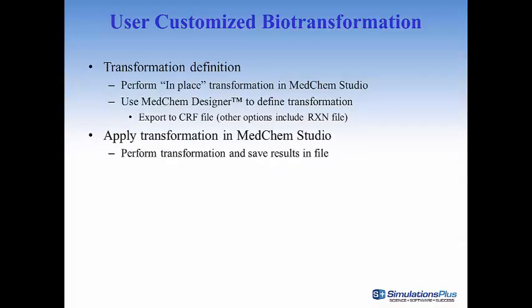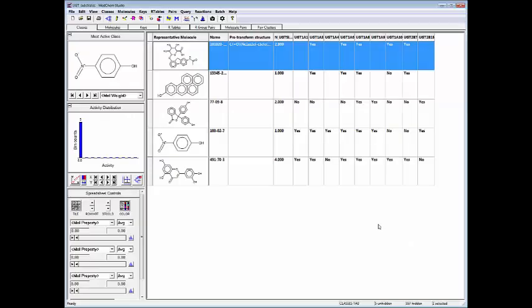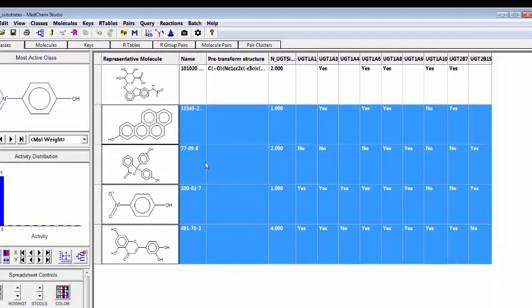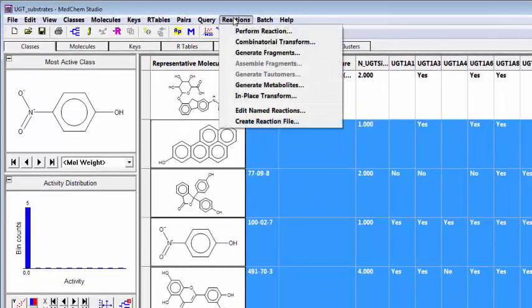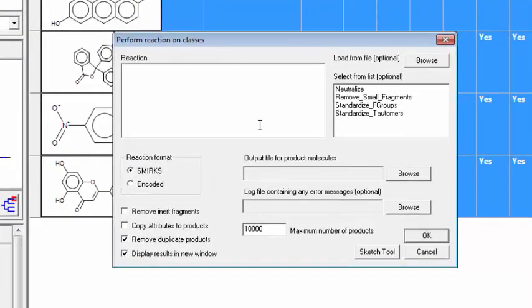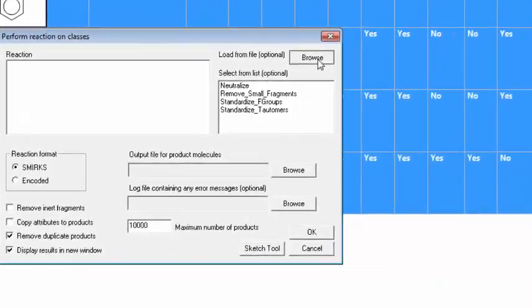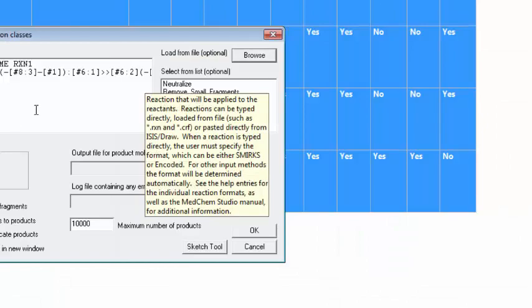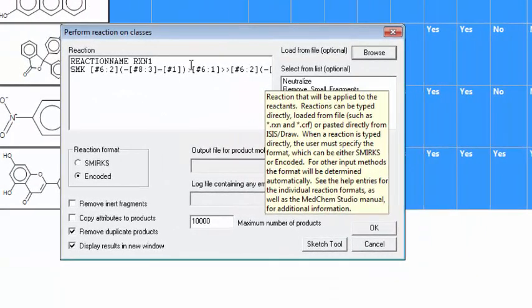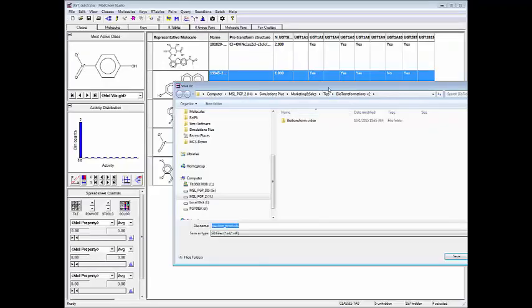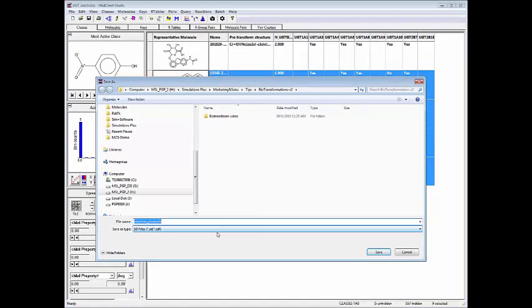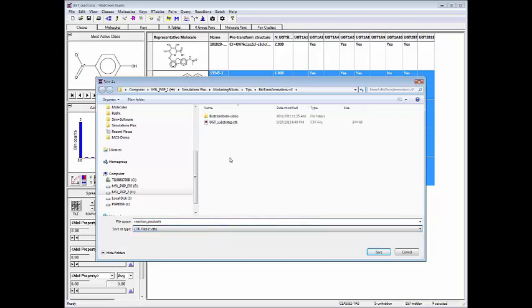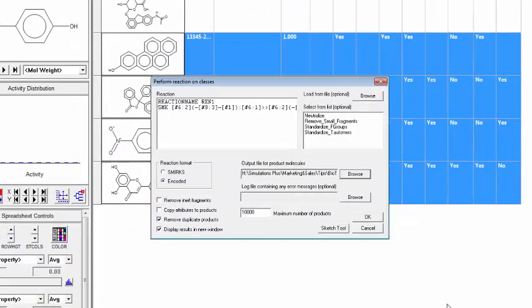Now let's go a step further and apply the transformation in Medchem Studio to the other molecules in my CTK file. Here I'm going to use the transformation that we created in the first step and apply those to the other molecules in the data set. And this will save the products into a file. So now I'm going to highlight the molecules that I want to apply the transformation to. I'm going to go up to the reaction menu and click on perform reaction to bring up a similar dialog box. Now I'm going to browse to the CRF file that we created in the previous step. Bring that in and then I need to specify an output file. And I'll create that as a CTK file and save it in the same directory. So click save.